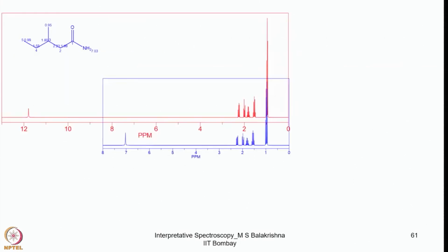Here you can also see I have given the IR spectrum for both the acid and the amide. This is for the amide and this is for the acid. In the acid the OH is here, and then here you see the NH. Otherwise this portion looks almost unchanged. So the catch is this one. However, one can also use NMR conveniently to see whether the reaction is completed or not. In both of them the products are very pure, meaning the OH group is converted into amide here. That can also be confirmed from NMR spectroscopy.